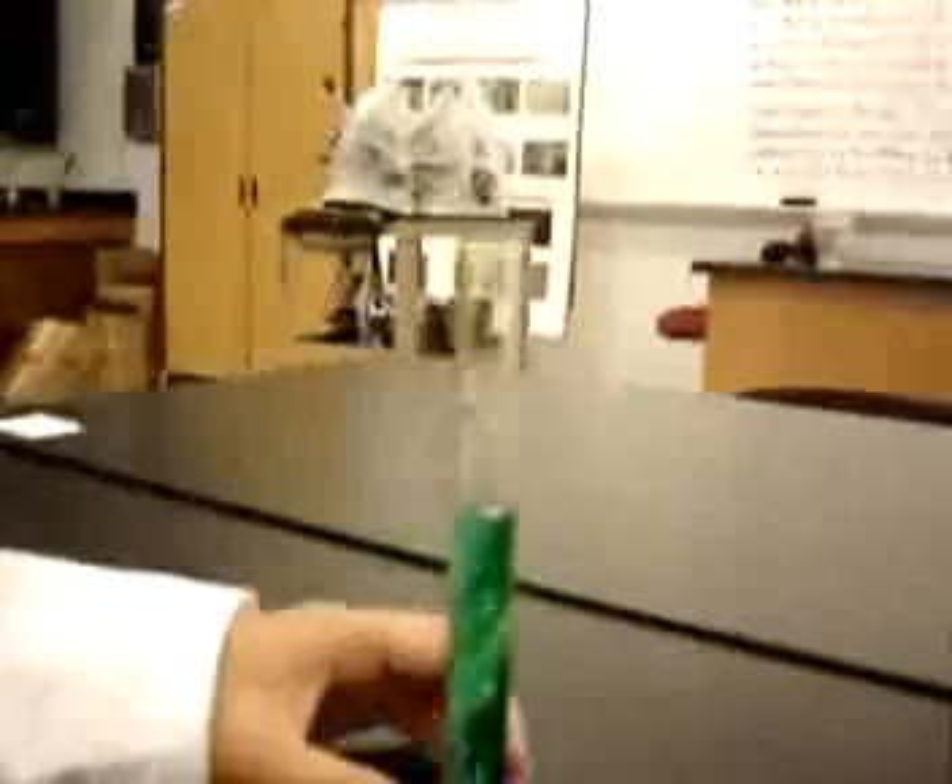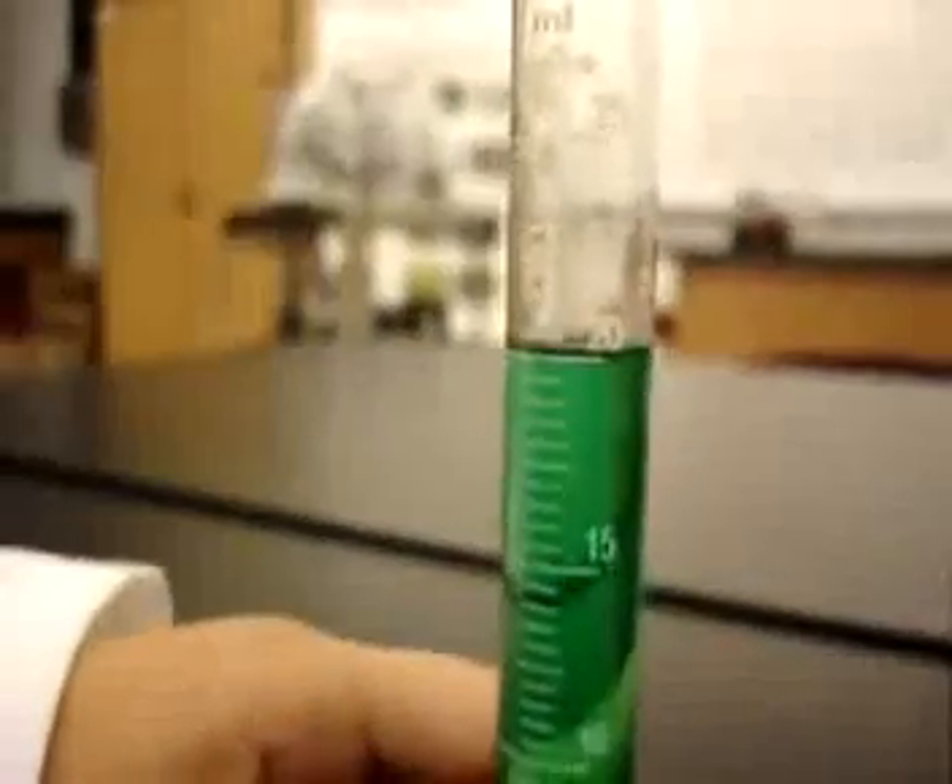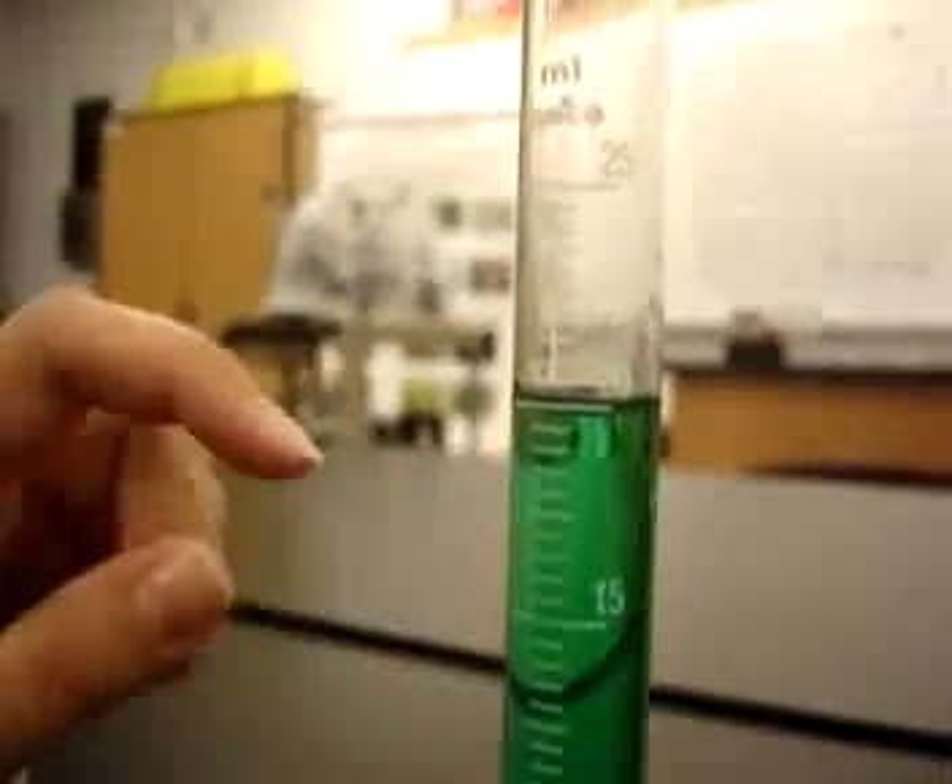At first glance, this appears to be 21 milliliters. But if you look closely, remember to use the meniscus, which means the middle.